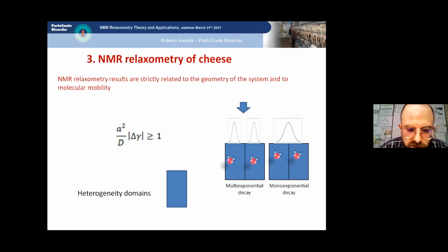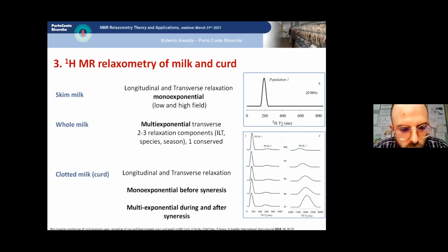When the diffusion is fast or domains small, NMR relaxometry will give a weighted average of the state of protons in all possible environments. It implies, for example, that by means of T1, T2, it is possible to investigate water diffusion, protein aggregation, presence and size of pores, protein hydration, and so on. Mono-exponential decay is due to fast diffusion of water molecules, that, as we said, sample all possible environments or compartments in the NMR time scale.